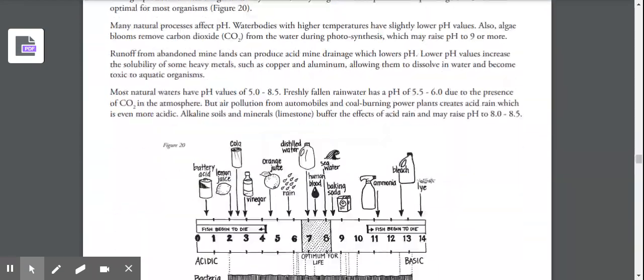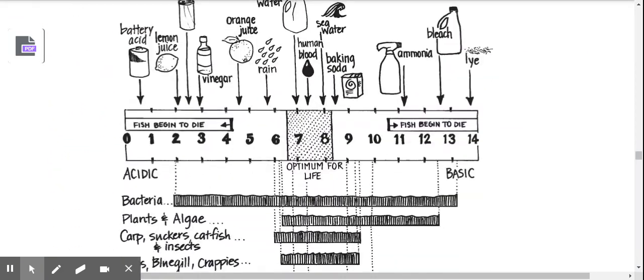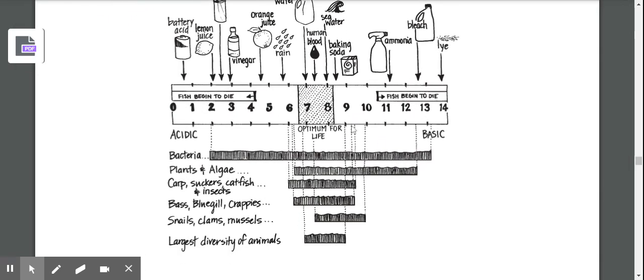Now for our pH group. What pH did you guys calculate? So the average of their pH was 9, which is high or low for water? The normal for water is 7. Your blood pH is 7 point maybe 4. So if we have a 9, that means it's basic. Soaps are basic. Like if the pH is 9, that usually means that it's a little bit high.